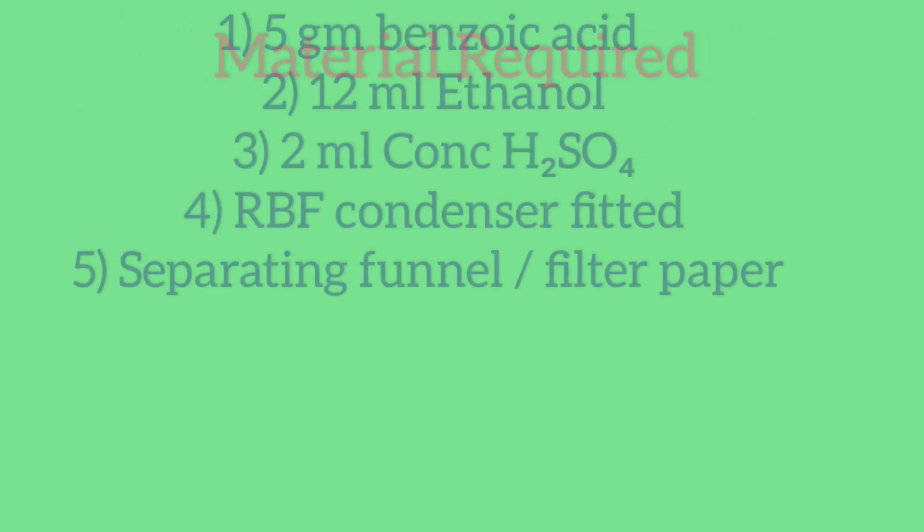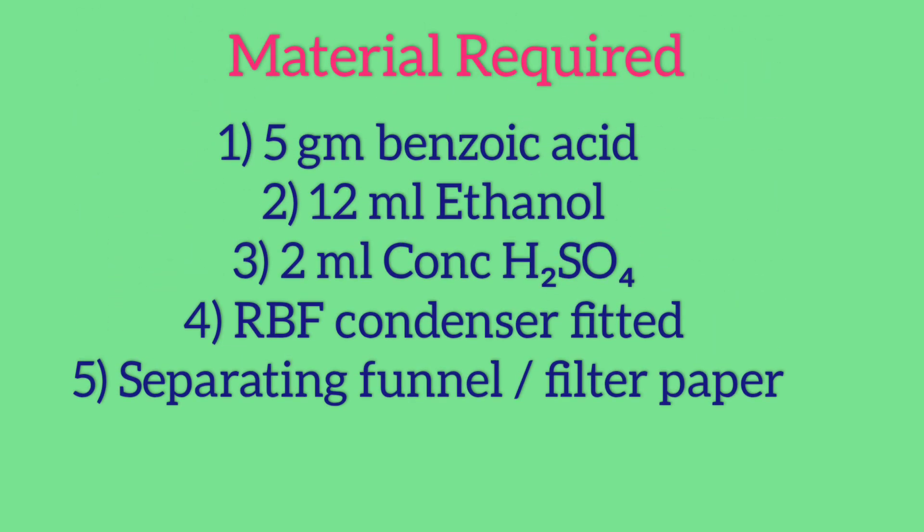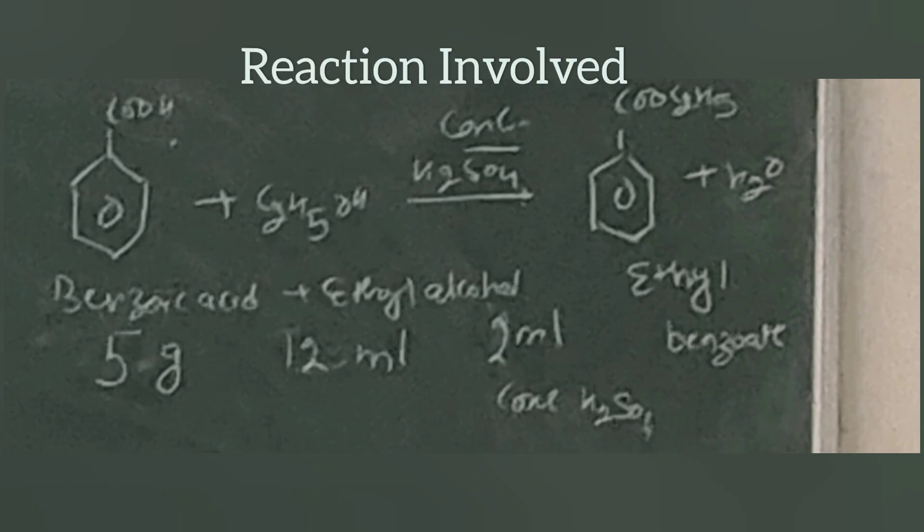This is the material required for the experiment and this is the reaction that is involved in this experiment. Here we have taken 5 gram benzoic acid and this is ethanol.